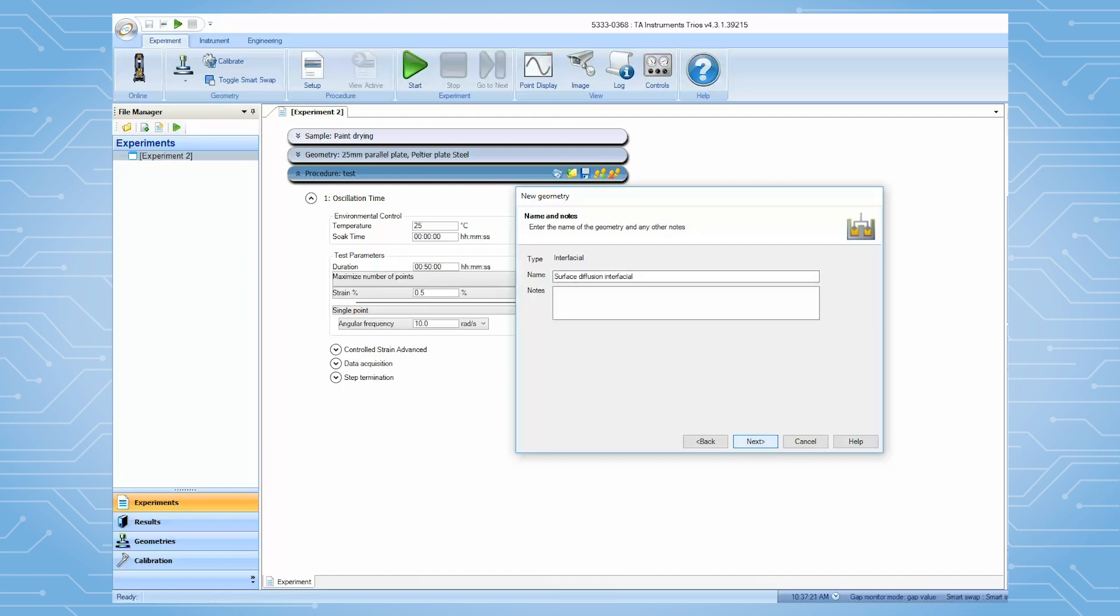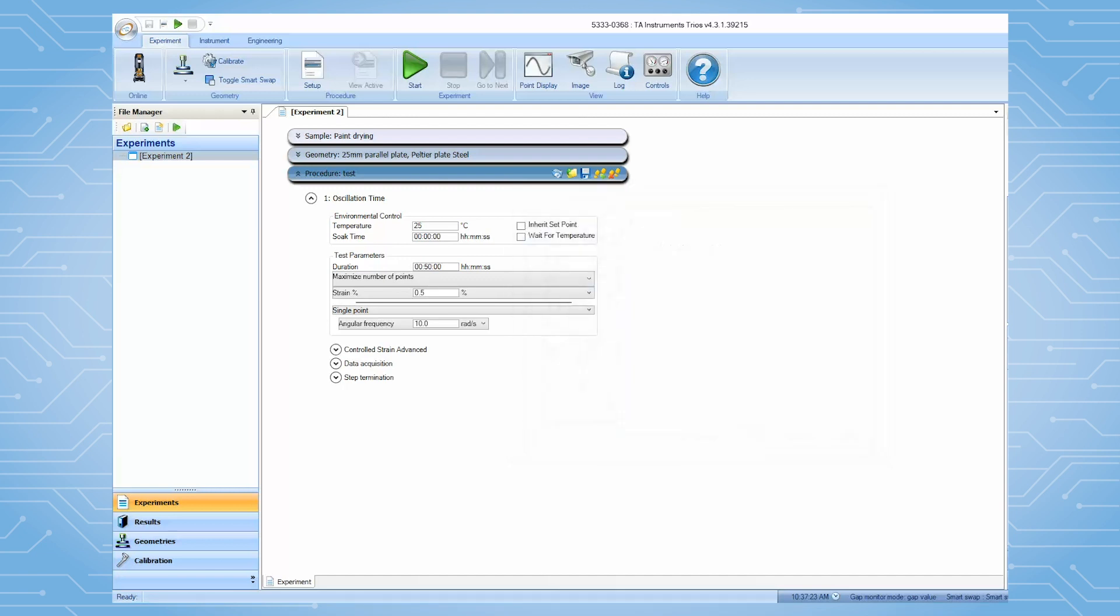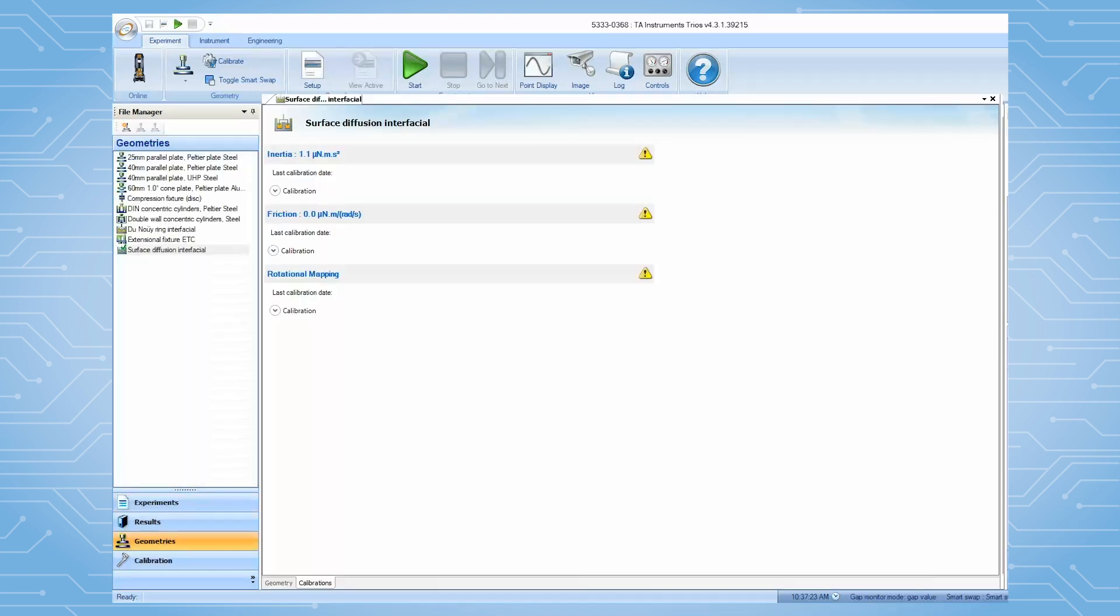TRIO will automatically lead you to perform the geometry calibration. The surface diffusion geometry calibration includes two steps: inertia and friction. The rotational mapping calibration is optional.